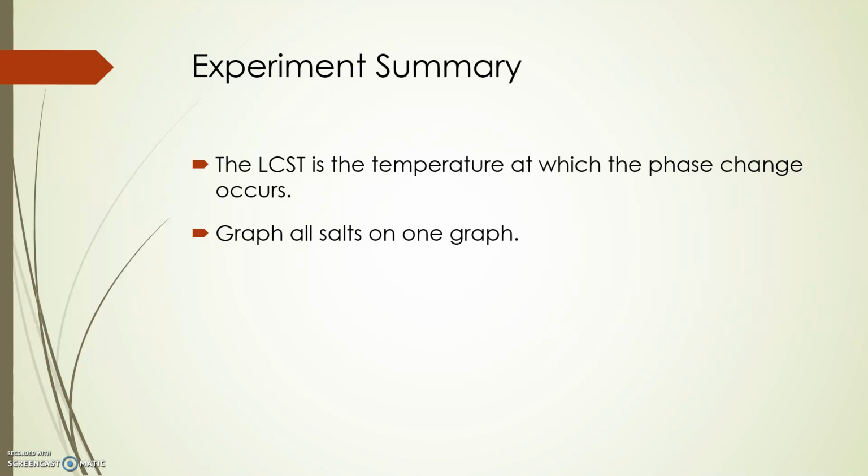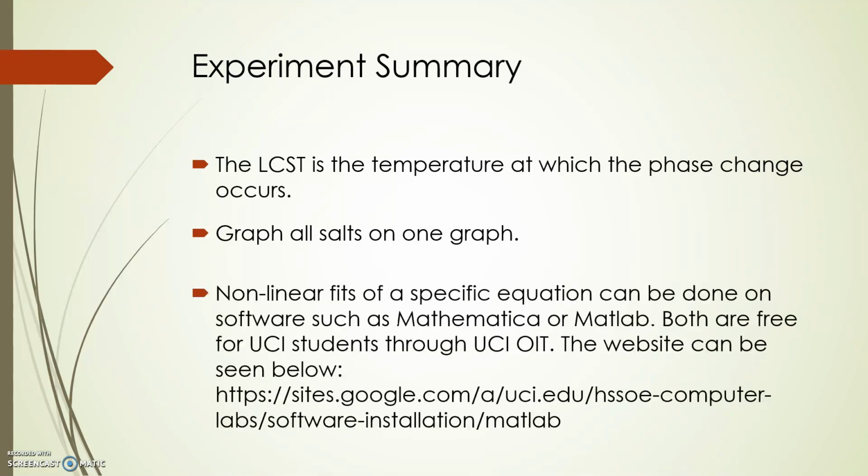In this experiment, you will also be performing a nonlinear fit to your salt data. A nonlinear fit can be difficult for Excel to perform, and there are other programs such as Mathematica or MATLAB that can do this for you. Both Mathematica and MATLAB are free for UCI students through UCI's Office of Information Technology. The website to download the MATLAB software is listed below.